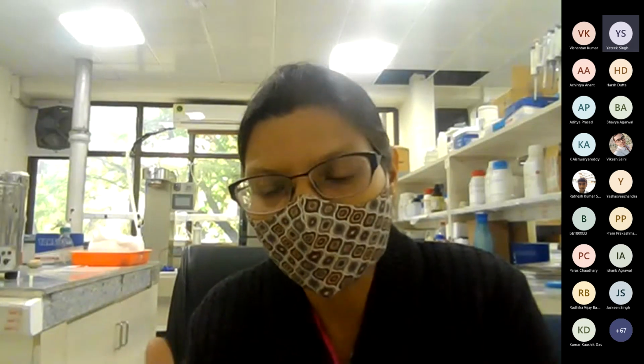When we compare uninduced versus induced, we get to know if there is a band intensity more than that present in the uninduced one. We get to know that our protein of interest is getting expressed. After that, we need to confirm it with different methods. But this is the preliminary step that we need to do. That's why we compare uninduced and induced culture. Got it?